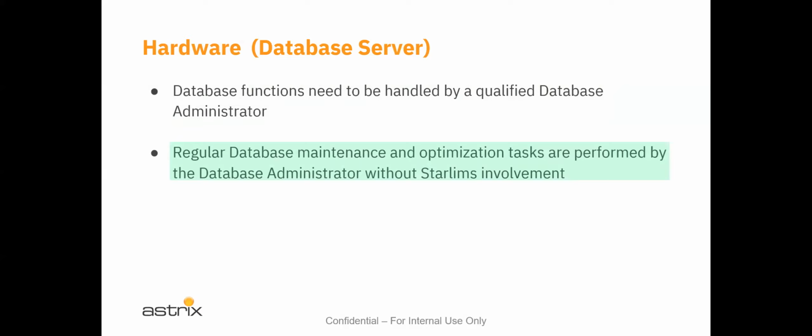Those folks, database administrators, handle the maintenance and the optimization tasks. So you're not required to be a DBA. It doesn't hurt to have that information in your head if you happen to have been trained to do that, and that always provides value-added components to your being a LIMS consultant, but it's not an absolute requirement.